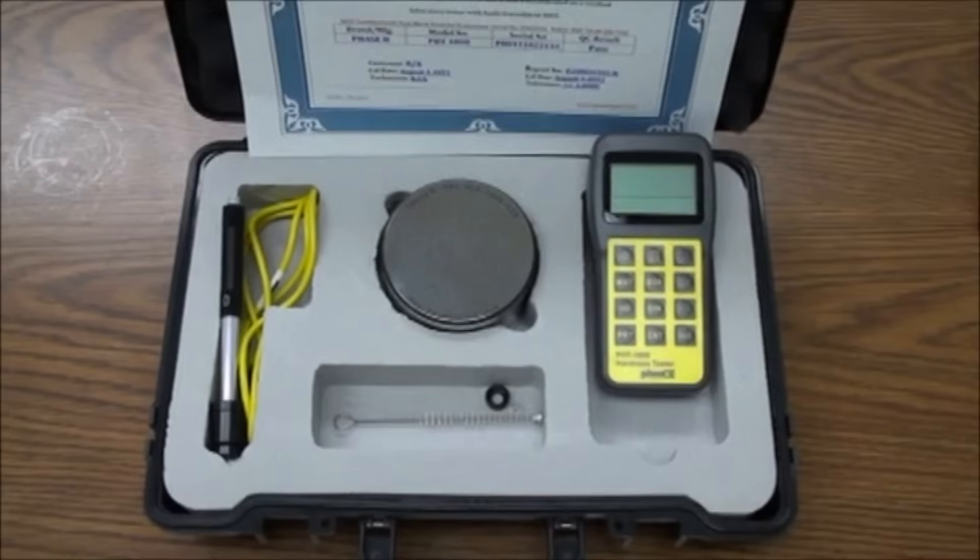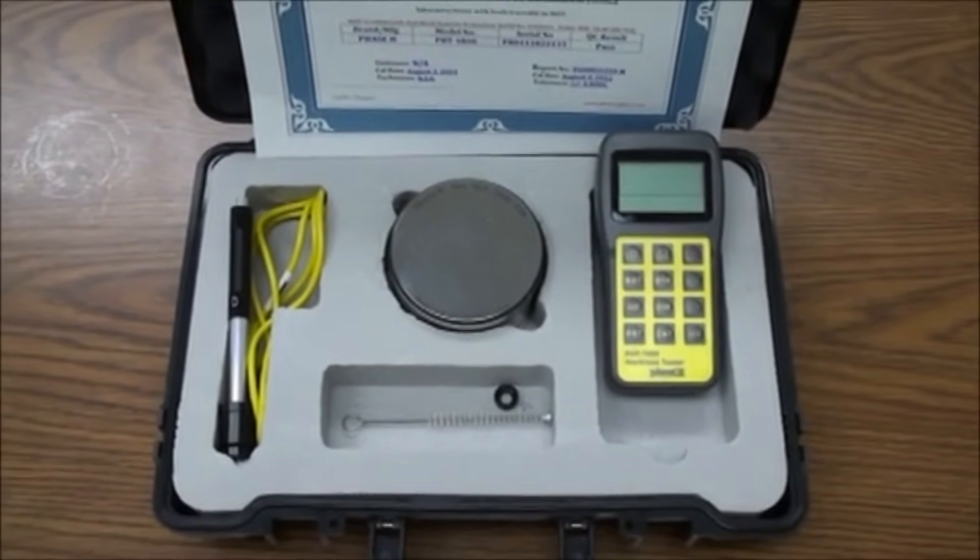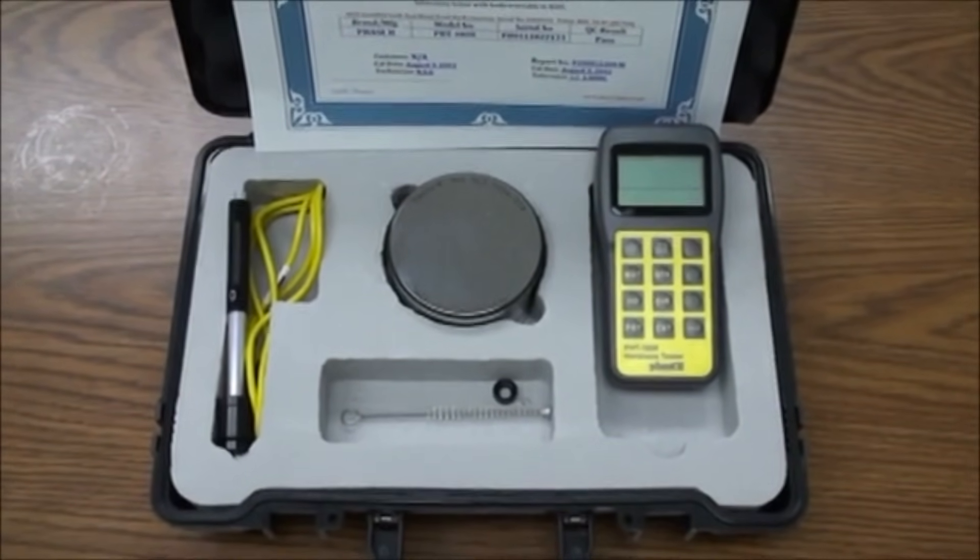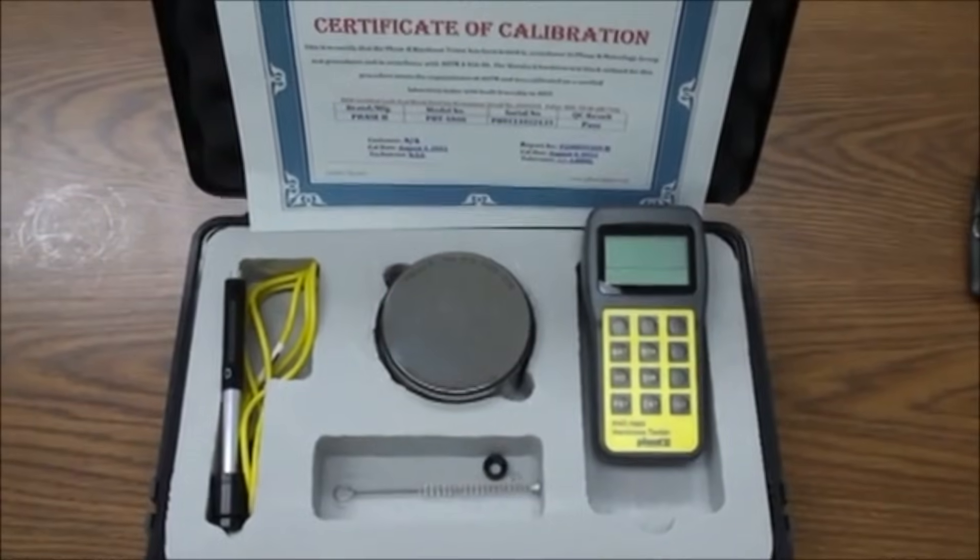The PHT1800 is designed to test metals, primarily steels, cast iron, aluminum alloys, and copper alloys.